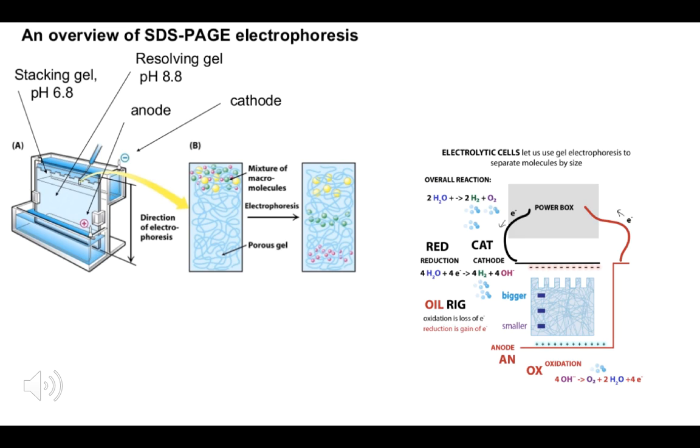So we use 5 to 500 base pairs. The smaller the percent of gel you use, the larger the range. So if you're using 3% gel, you're going to be using 100 to 1,000 base pairs. But if you're using 20% gel, you're using 5 to 100 base pairs. And so the main difference between native gel electrophoresis and SDS is that SDS is for smaller things and has way more small lines in it microscopically, versus native gel, which has much bigger lines.